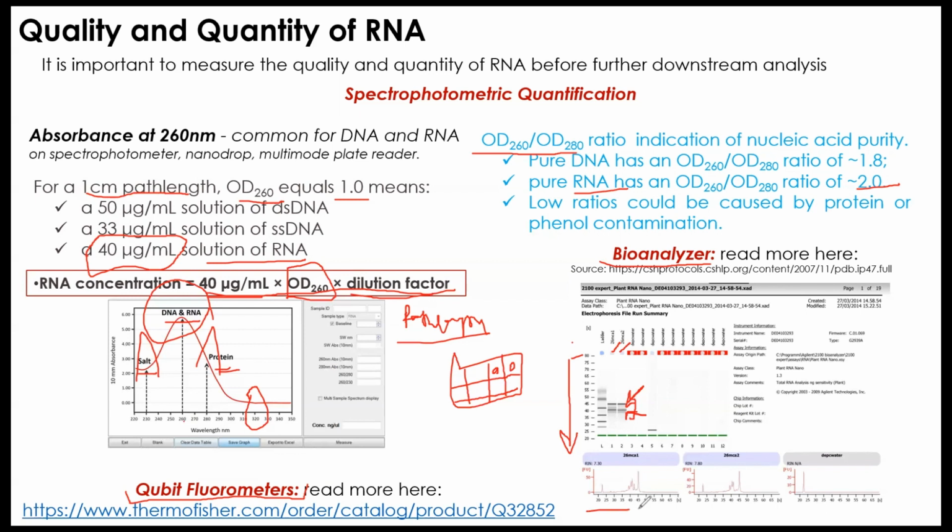And in this electropherogram, if you look here, you have one band at 45 seconds, and the other major band at 40 seconds, right? And along with that there are a few, and this is for the distilled water, so this will always be there in the water. For example, you can see here the DEPC water, right?